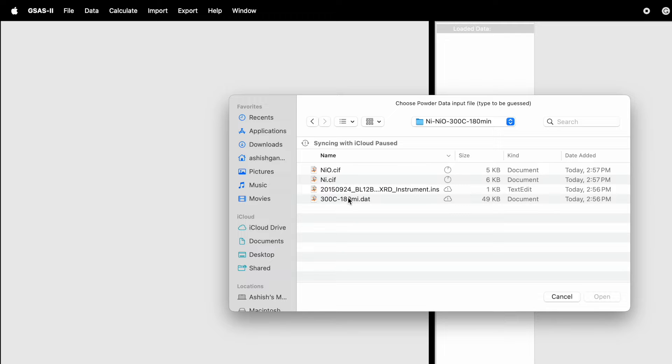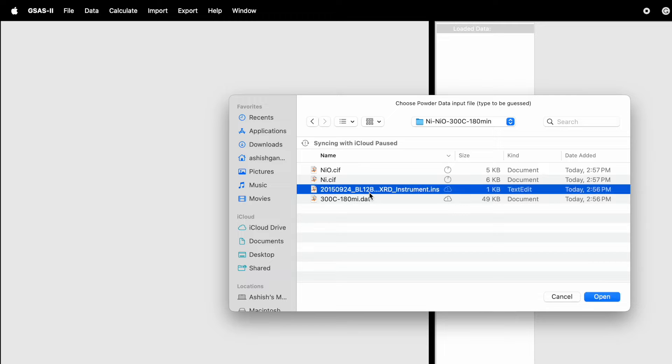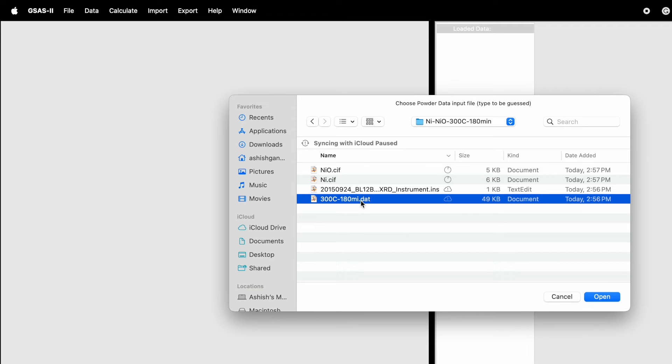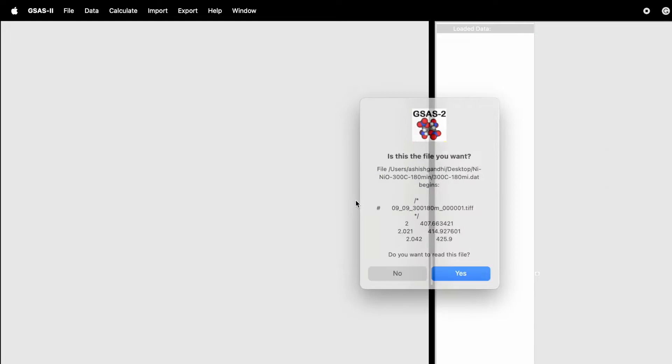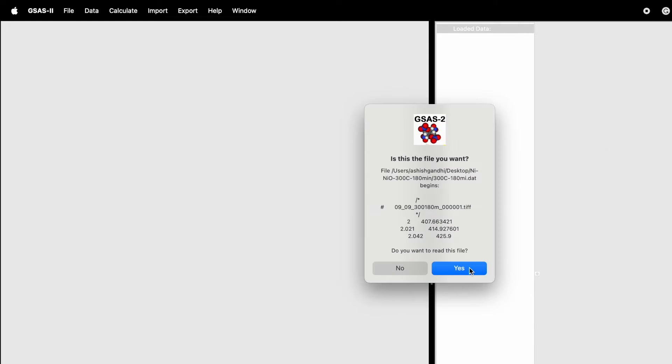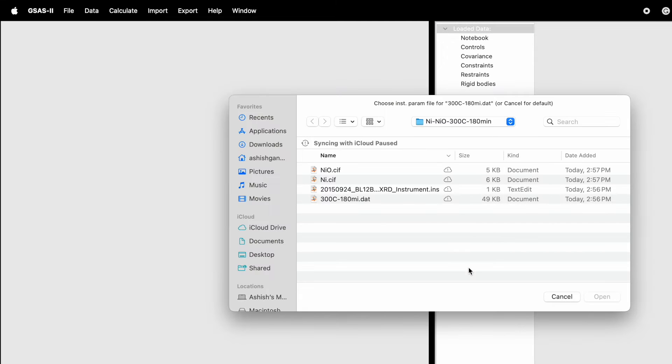The folder contains four files: two CIF files for nickel oxide and nickel, one instrument parameter file, and one data file. Double-click on the data file.